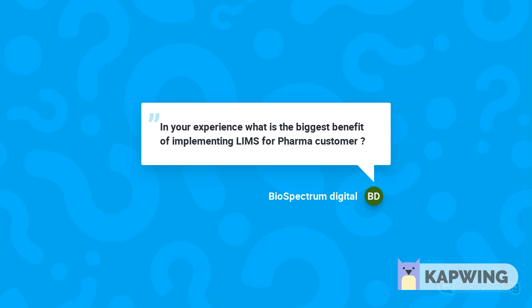Not complying to regulations is a huge risk to the business, and we are talking about medication that humans take. Humans that are most likely sick. So, product recalls are a huge risk to the reputation of a company, and most importantly, to patient safety. LIMS just makes compliance easier and makes it more noticeable when something goes wrong, so corrective action can take place before a disastrous scenario happens.